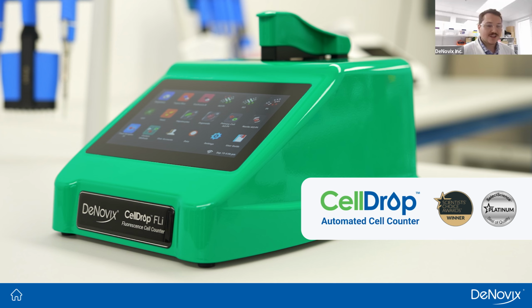Thank you, Andy, for that introduction. Before we begin, I just want to tell a very quick and brief story. During my graduate studies at Villanova University, my research focused around macrophages, and I began by counting them manually with a hemocytometer. And I really wanted something to streamline that process because, let's be honest, it is a very laborious process. Luckily, my neighboring lab has a CellDrop, and I was able to use it. And I don't want to say this instrument's the reason why I finished my project 3 months early, but it had a big part in it.